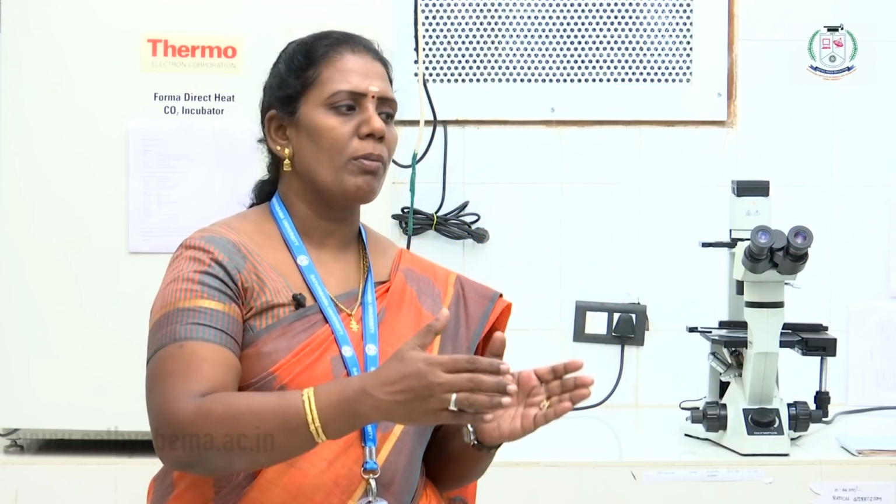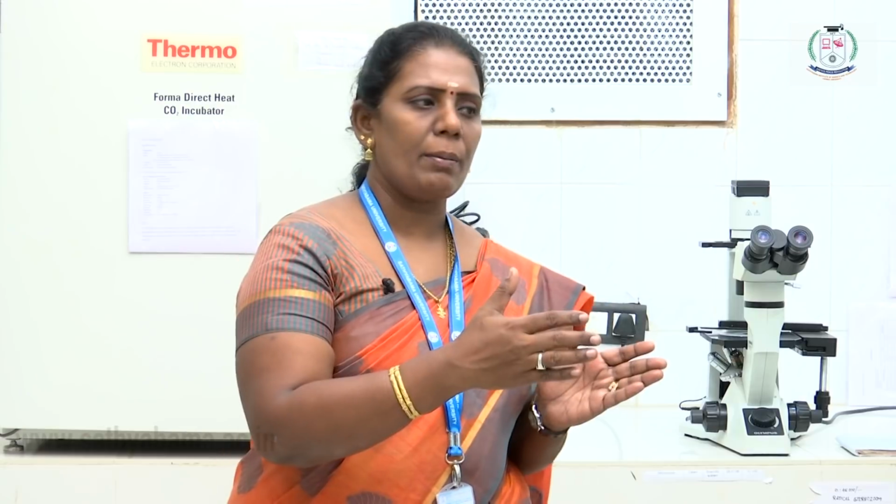Next are the varieties of instruments. The first one is the laminar hood. The laminar hood is nothing but the place where we sit and perform the experiment. In this laminar hood, that particular environment has to be totally free of contaminants. If any contaminants or microbes are there, that will fully spoil our system. So that has to be regularly fumigated, and it should be totally sterile, and only then we start our work. The second one is the CO2 incubator.